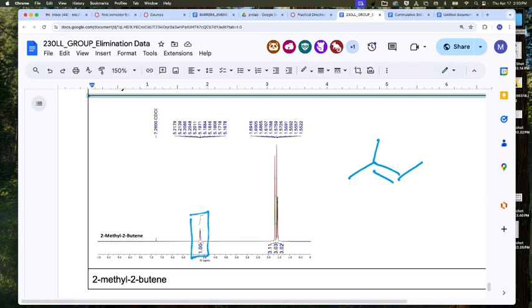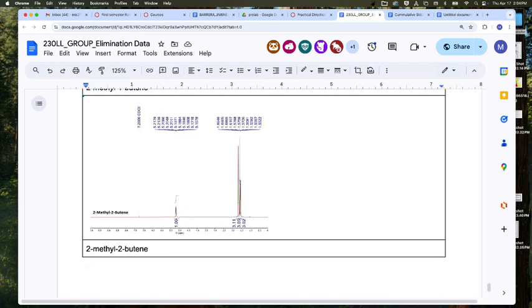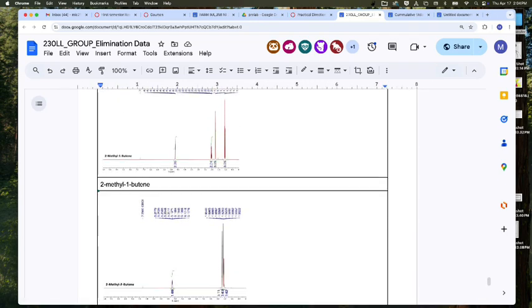We're not trying to create a ratio to look at the different number of hydrogens. We're trying to create a ratio that represents the different amount of molecules present, which means we have to take into consideration the integration within this. Okay? The amount of hydrogens within our individual structure. So what does that mean? Well, what that means is we're now going to zoom out because we don't need to see this quite as carefully. And we're going to try and summarize this a little bit.